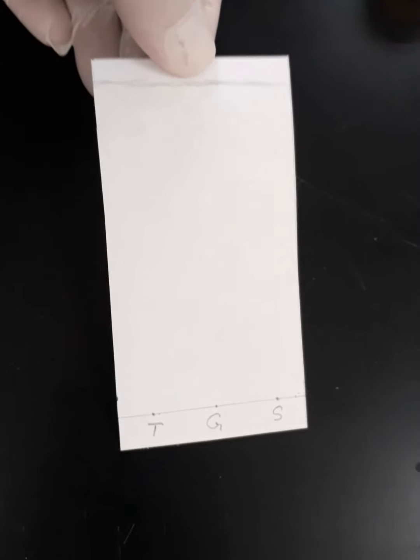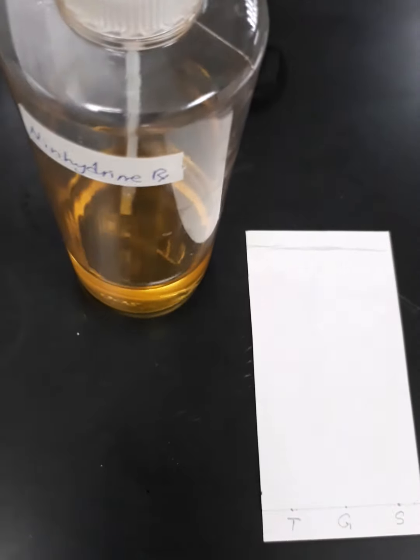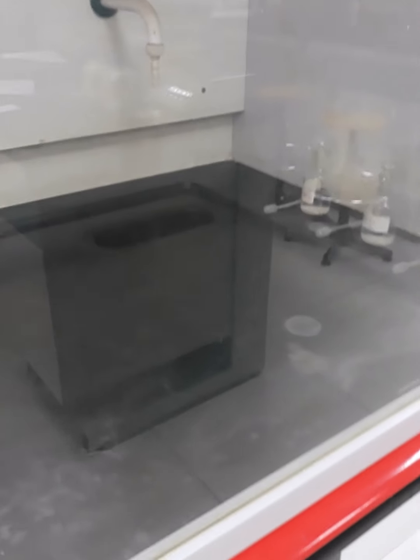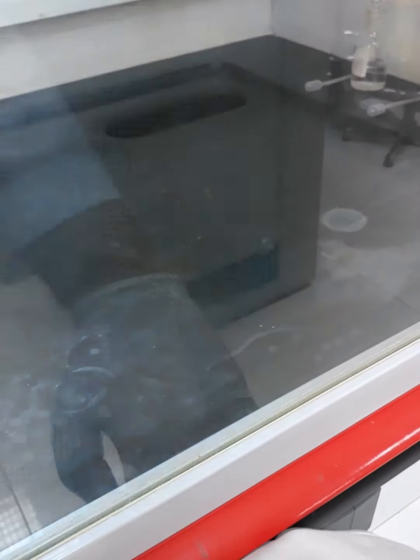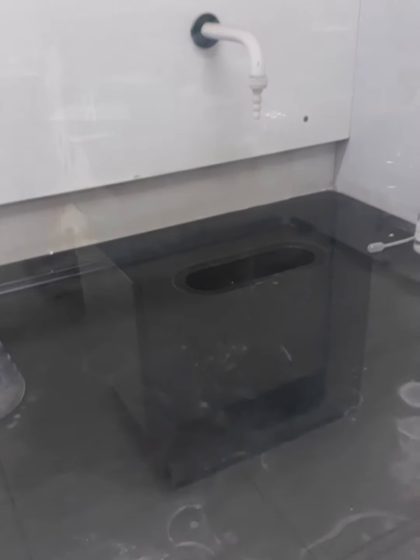Now, after complete dryness of the chromatogram, we are going to apply our chromogen, which is ninhydrin solution, and we are going to do that inside the fume cupboard. So now we are going to use the fume cupboard to apply the ninhydrin spray over the chromatographic paper after the development. So now we are going to turn on the lights and the suction force. Then we have to place our hands right here to make sure that there is sufficient suction force to take out any toxic gases inside the fume cupboard.